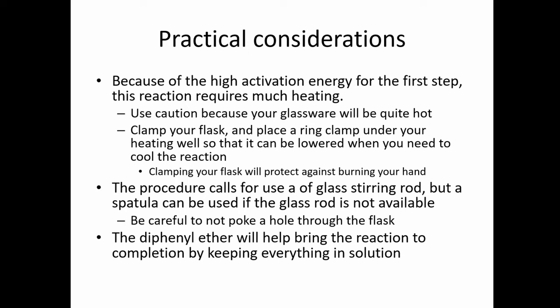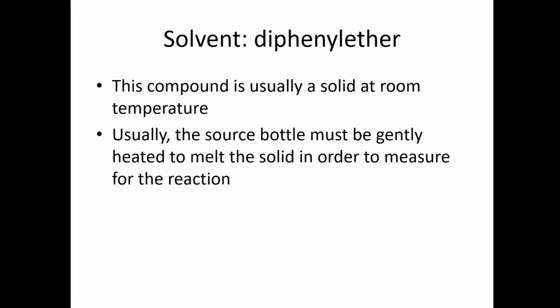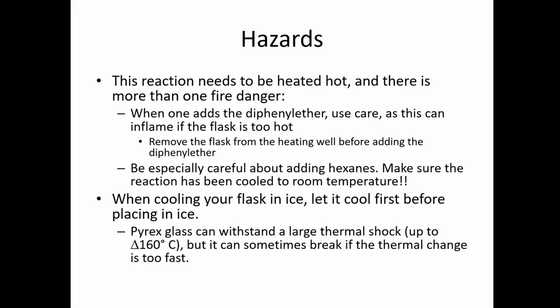The diphenyl ether is the solvent that we'll be using to bring the reaction to completion by keeping everything in solution so that nothing precipitates. Our solvent, diphenyl ether, is usually a solid at room temperature. Because of this, you would have to gently heat it to melt it a bit so that you can measure it properly for the reaction.